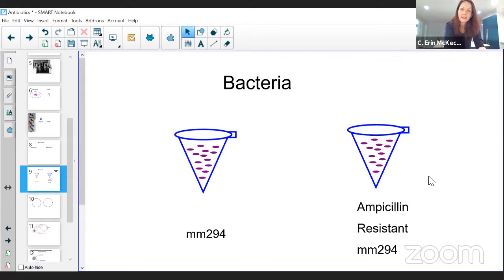What do you guys think? No, it does not. So I like using the kanamycin because I'm going to show that just because bacteria can resist one antibiotic does not mean that they can resist all. I'm going to start the experiment. I think it'll make a lot more sense once I start showing you the materials, but I wanted you to have a little bit of background.